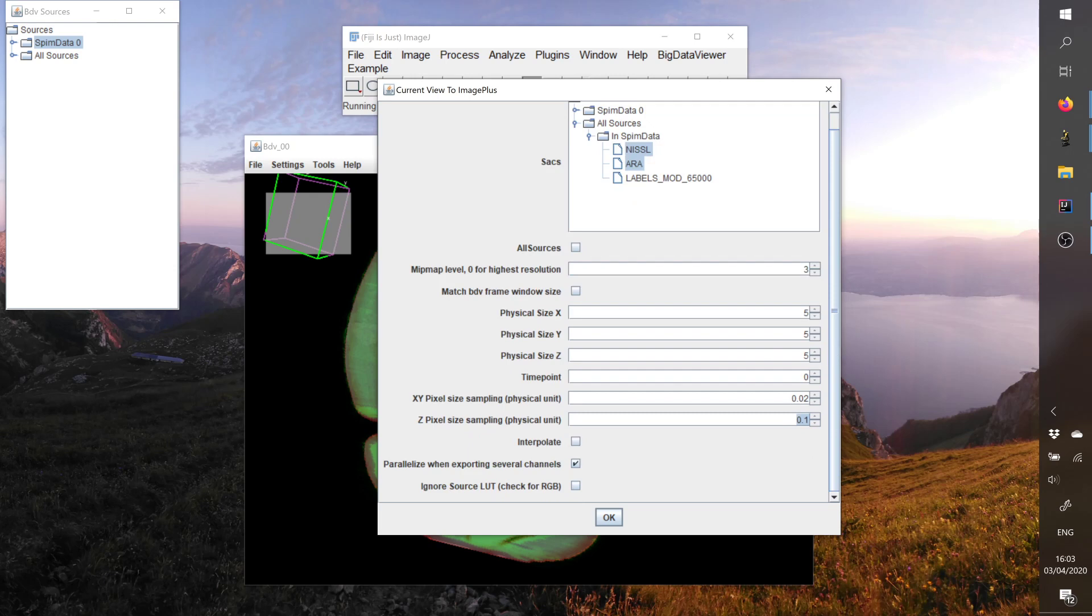So then I should do the computation. That's a bit complicated, but we should be in the range of 250 pixels, something like that. And we can click safely parallelize export.